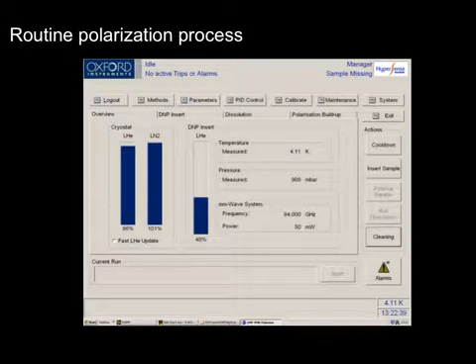Okay, so I'll take you through a little bit about the software now too. The bomb has to be filled with helium gas. Okay, yeah, that's what I thought. Oh, okay, yeah, that's a good point. Right, so that makes perfect sense. So you couldn't use just regular air in there. You have to use helium gas for that. So you pressurize the bomb with that same helium tank.